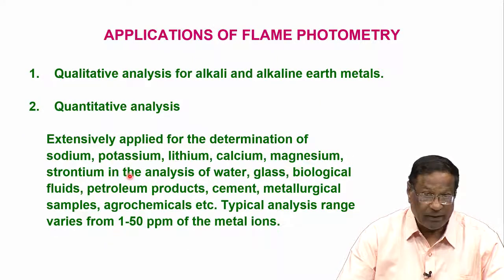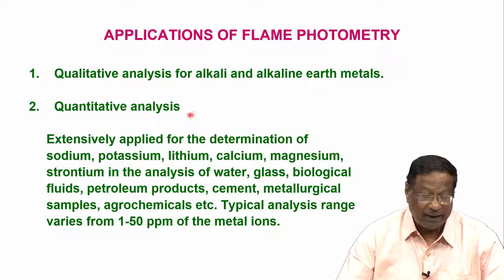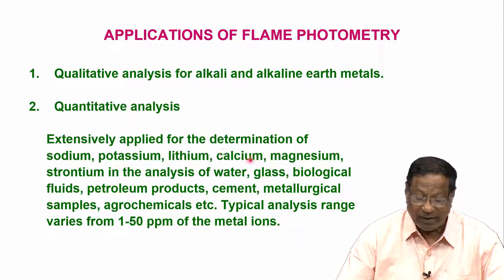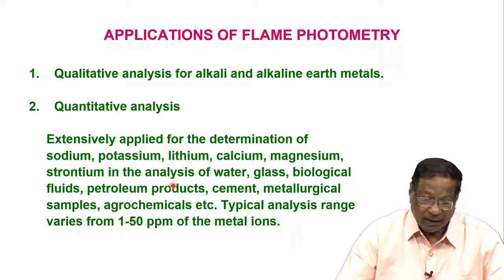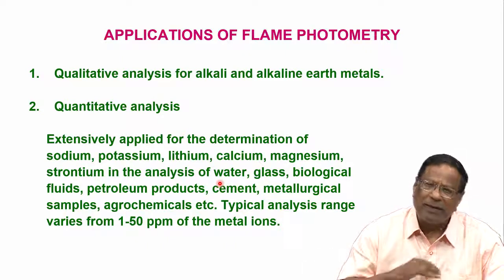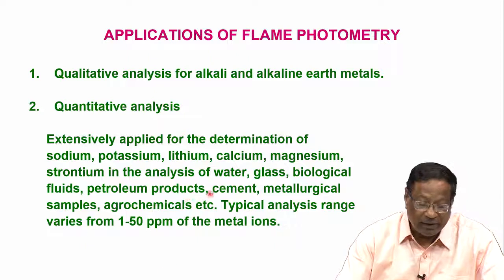So, with this amount of knowledge, we can look at the applications. One is qualitative analysis of alkali and alkaline earth metals, and then we can do the quantitative analysis. But flame atomic emission is extensively applied for the determination of only these elements: sodium, potassium, lithium, calcium, magnesium, strontium, barium, etc. They are applied in the analysis of water, glass, biological fluids, petroleum products, cement, metallurgical samples, agrochemicals. The list is almost endless, including even the pharmaceuticals.